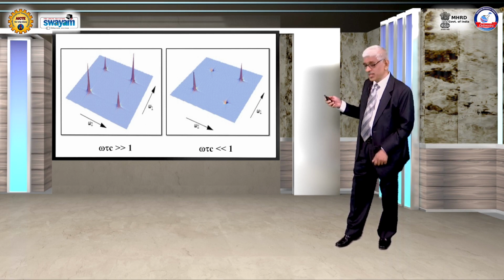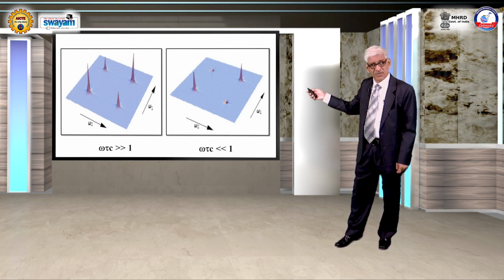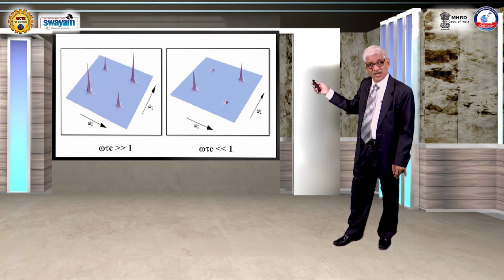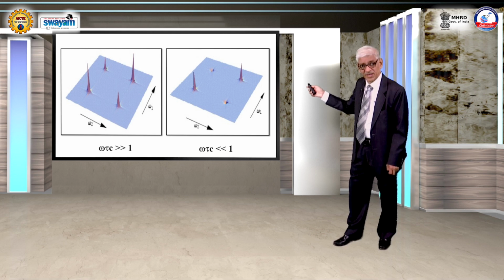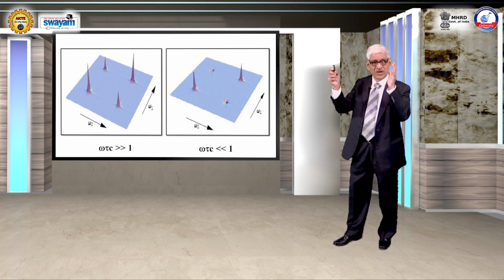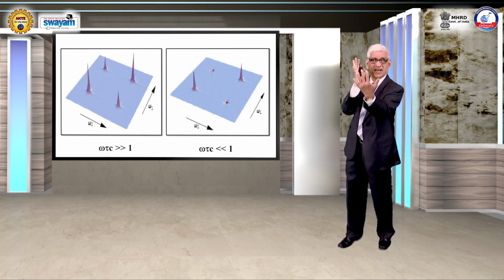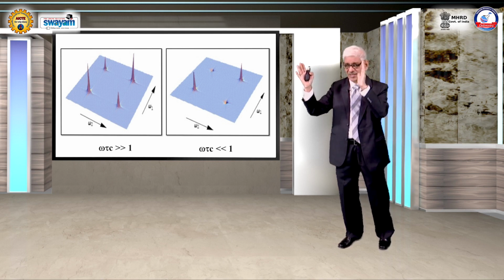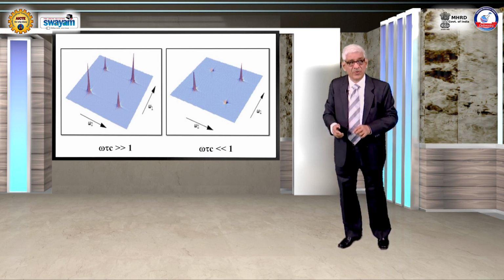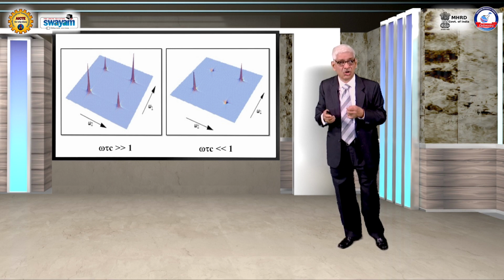In that situation, you can see differences in your spectrum. So you have the two diagonal peaks going in one direction, and the two cross peaks have the same sense as the diagonal peaks if the molecule is tumbling slowly. But if a molecule is tumbling faster, then you will have the diagonal peaks having one sense and the cross peaks having opposite sign, going down below the plane. So in one case the diagonals are like this, the cross peaks are like this. In the other case you have the diagonals like this and the cross peaks are like that, so going down. So this will allow you to figure out whether your molecule is tumbling very rapidly or not in your solution.